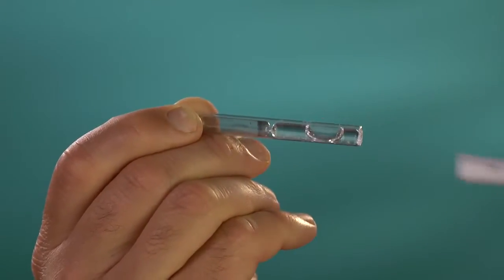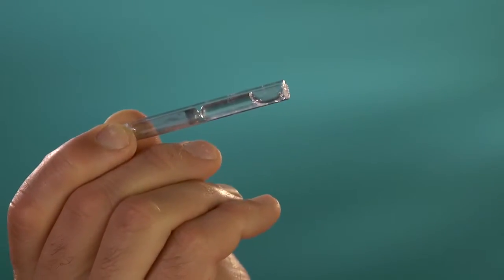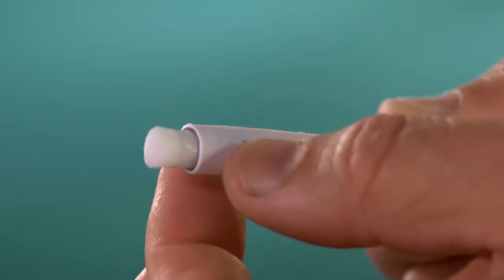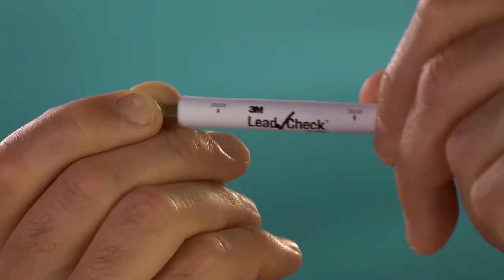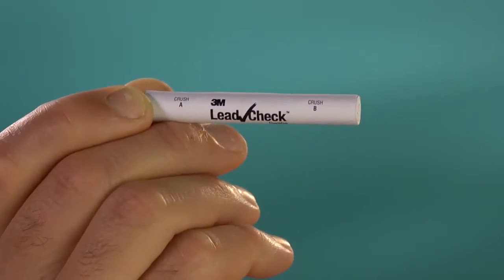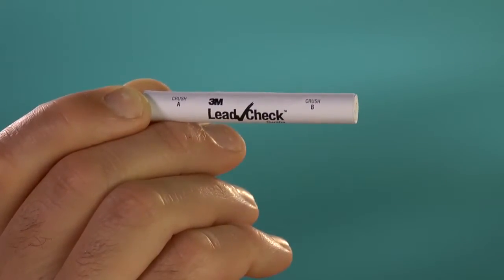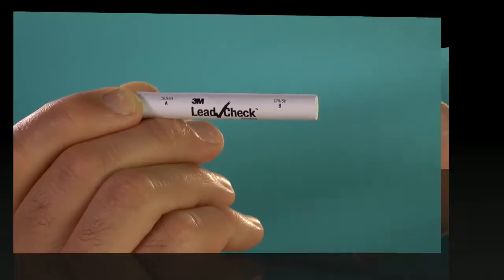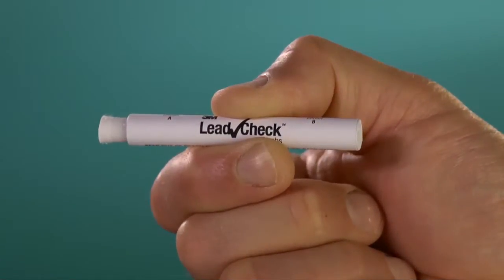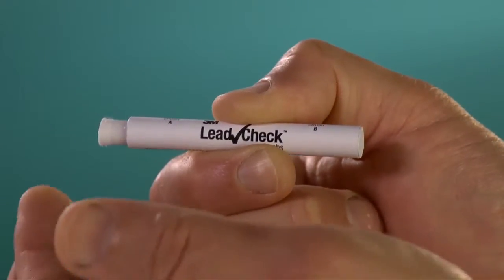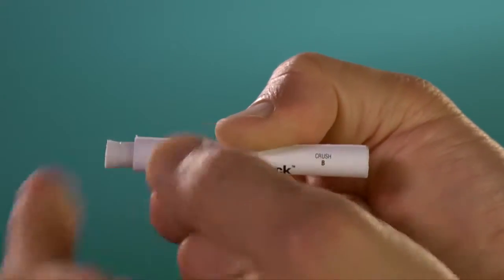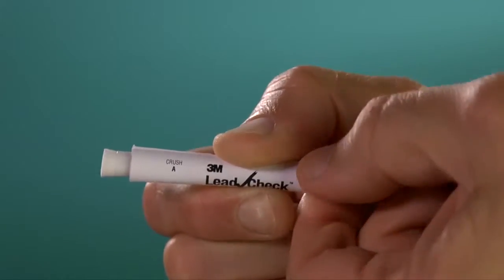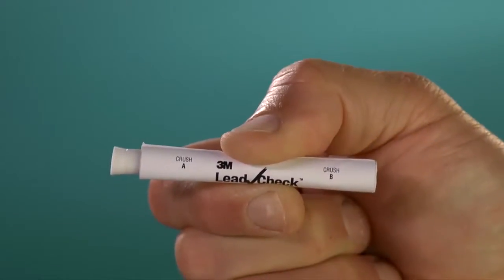Note that there are two separate glass ampules inside each 3M LeadCheck swab and that both must be crushed to activate the reagent liquid. Do not crush these ampules unless the cardboard cover is in place, completely covering both of the glass ampules. Now, activate the 3M LeadCheck swab by firmly squeezing each end at the points marked A and B on the cardboard cover until you can feel and hear the ampules inside being crushed.